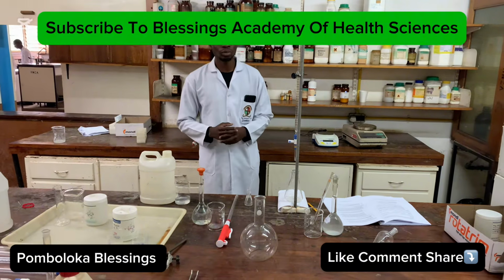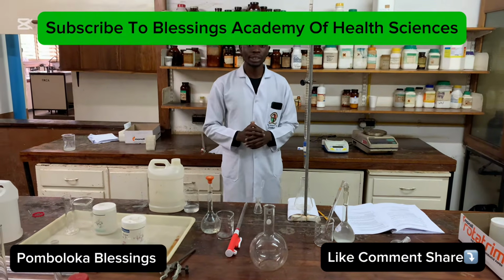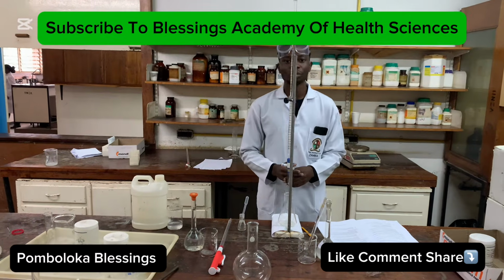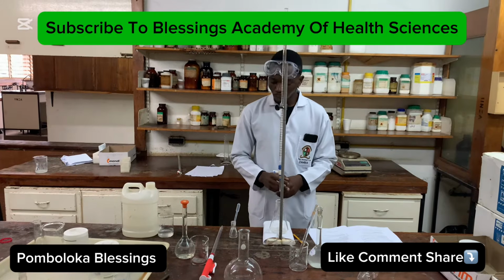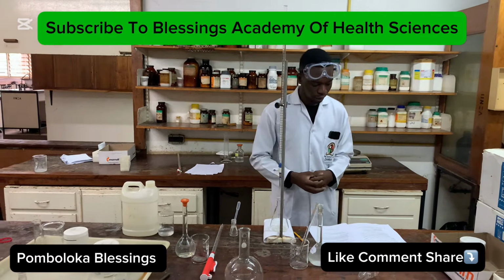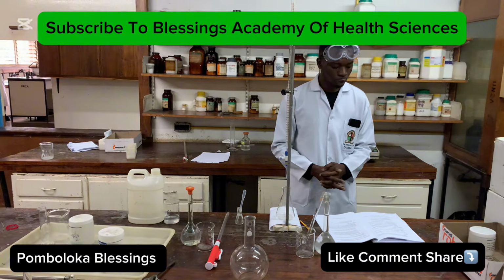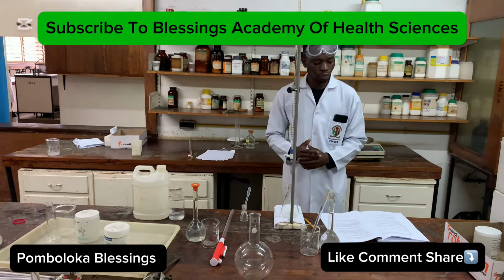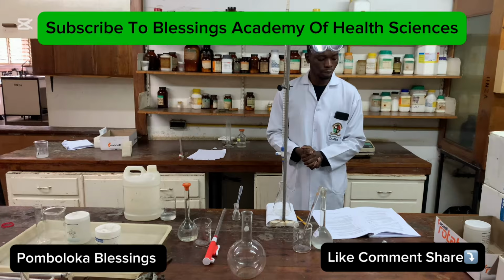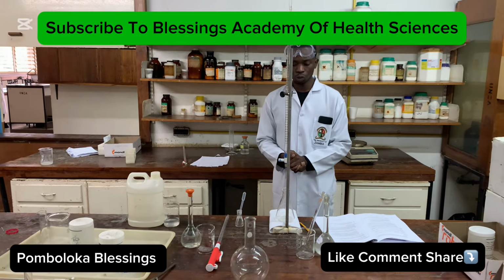Remember in the first part of the video, I made a clear distinction between the analyte, the titrant, as well as the other important parts that we need in this chemical reaction. So now, what's the first part of the procedure? The first part of the procedure tells us we are supposed to pipette 5.00 cubic centimeters of the ammonia solution into a 250 ml conical flask and pipette 25.00 milliliters of 0.1 HCl and add it to the ammonia solution.